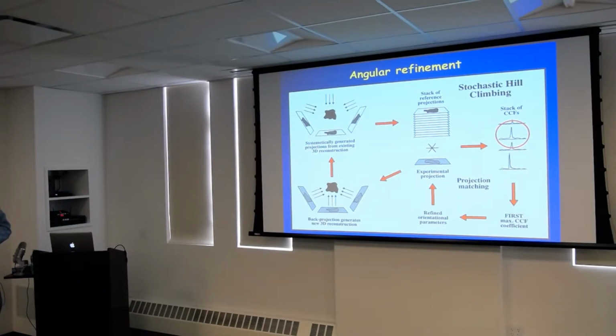So what do you call this? It's cross-correlation, right? It's a similarity comparison. I think it's convolution. Is it convolution or multiplication? I'm actually not quite sure at this point. It's a convolution. But you end up with a map that shows you, if it's here, how similar the two images are, for each pixel. Then you just choose the highest peak, and the highest peak is your highest cross-correlation value, which is the exact copy.